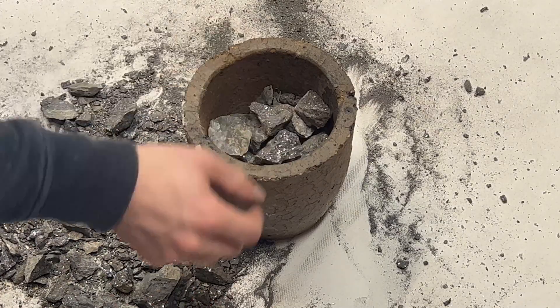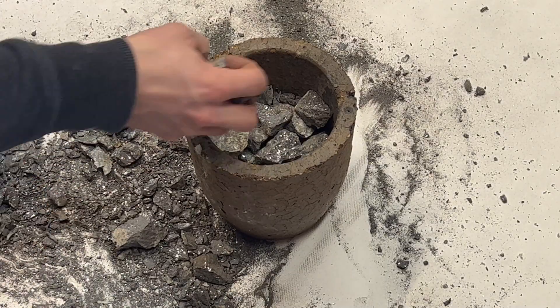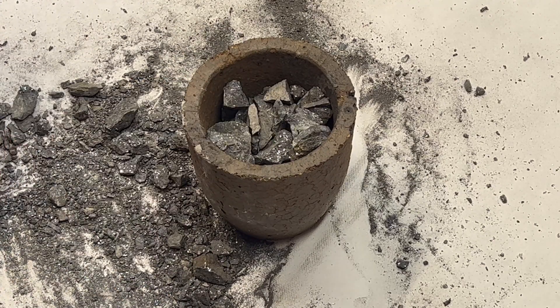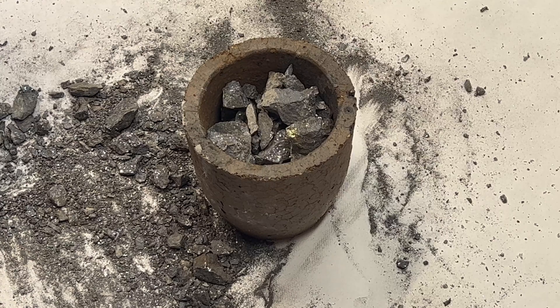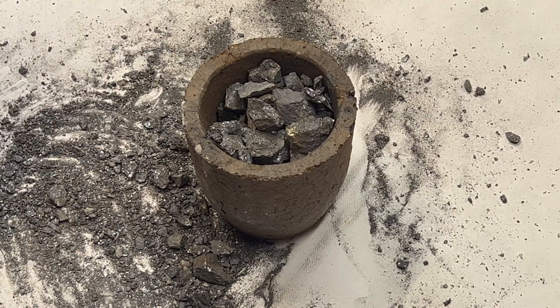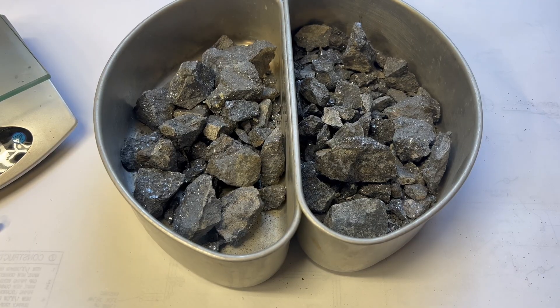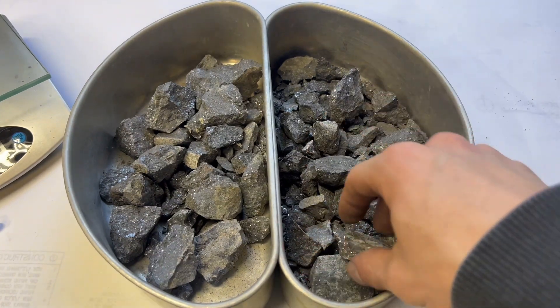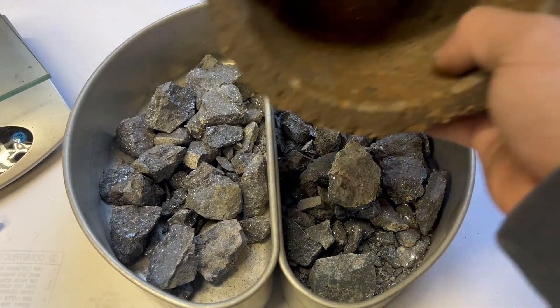Now with all the rock crushed up, I started filling up my crucible, and I quickly realized that I was going to have to do 2 runs — all the ore was not going to fit into 1 crucible. I divided up all the crushed rock into 2 equal portion runs, so that they can actually fit in the crucible along with the flux material that I needed.